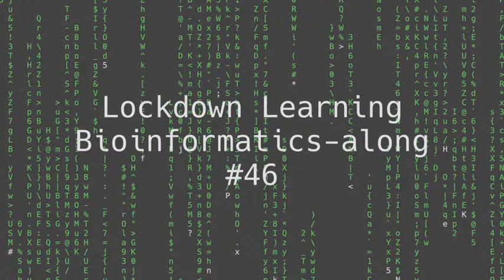So, it's a new week and we're going to take a look at some more bioinformatics tools this week, some things that we haven't explored so far. Beginning today with an extremely used set of tools called SAMTools. So when we ran our alignment last week, last week revolved around running Bowtie 2 to generate a short read alignment to a reference genome.